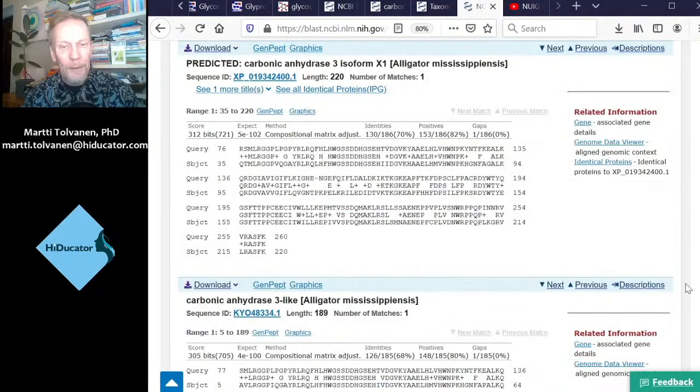Yes, here we go. So this is an isoform, one alternative predicted version of splicing, or a version of a selected start site. And you can see, looking at the numbering here, that this is about 30 residues shorter.